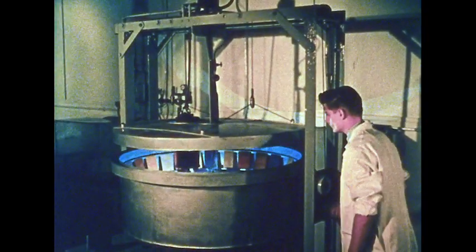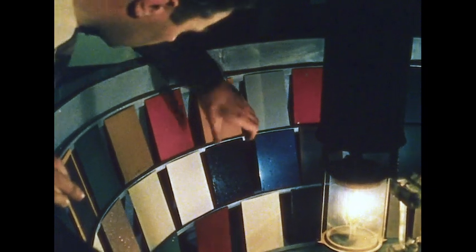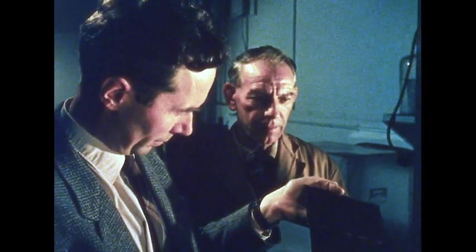The paint makers expose samples to wear by light and water, simulating years of use in a short time. A weathered sample can be compared with an unused one. A carbon replica shows that the unused paint has a generally uniform surface. But in the weathered paint, the binding material has worn away.